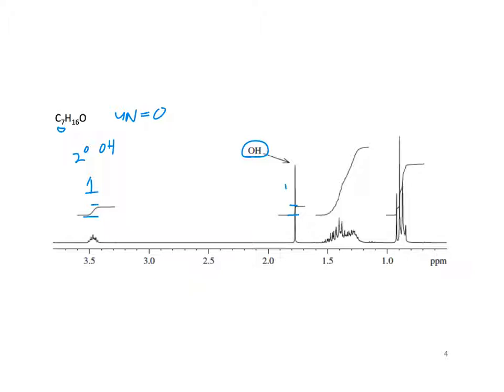So it's a little trickier looking at these other ones because they're so big. So how about down by the methyl group range? How big do you think that is? Probably 6. So how many does that leave us left over? 8 under here. So it's just a big jumble in there. So let's just think about the possibilities then. Do you think that the carbon chain could be branched?